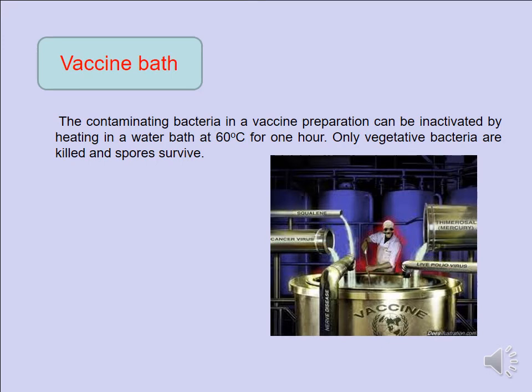Another method is the vaccine bath. The contaminating bacteria in a vaccine preparation can be inactivated by heating in a water bath at 60 degrees centigrade for 1 hour. Only vegetative bacteria are killed and spores survive.